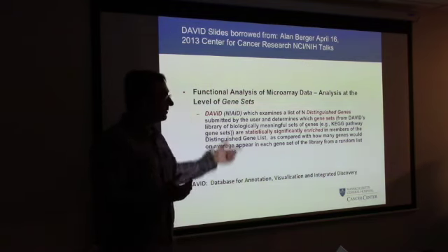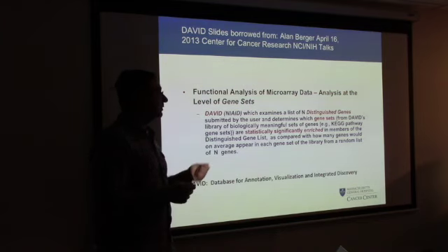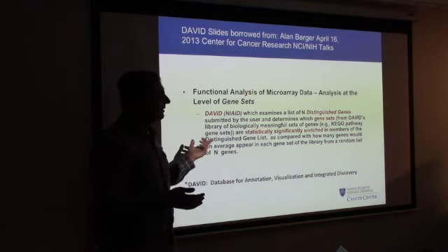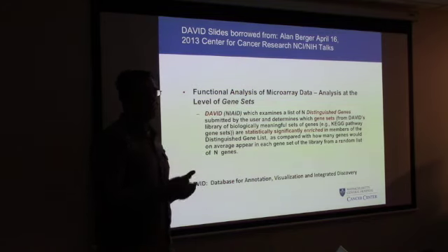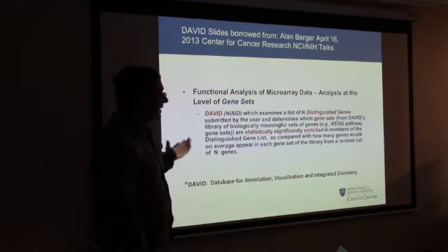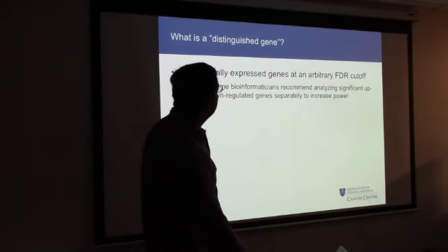So the fact that David was written by a statistician, sometimes the underlying algorithm is different, and it'll give you some different results, but most people here tend to use GSEA from the Broad, so feel free to use that. I use David. Sometimes I would recommend people to use it as a sanity check. So just make sure that the gene sets that you're getting enriched also appear enriched with David. Right? So that said, since I'm talking about this, I'm going to go over in a little more detail and show you how to use it.